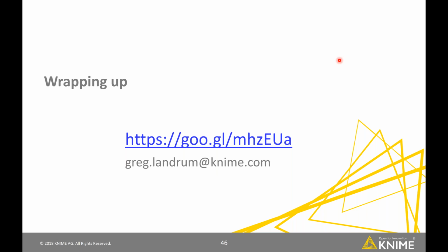So there are a huge number of community nodes available from Knime. Which do you find the most useful, obviously, apart from RDKit?